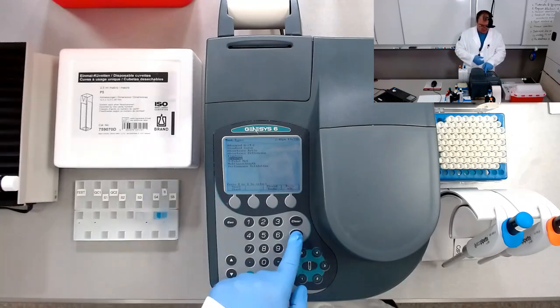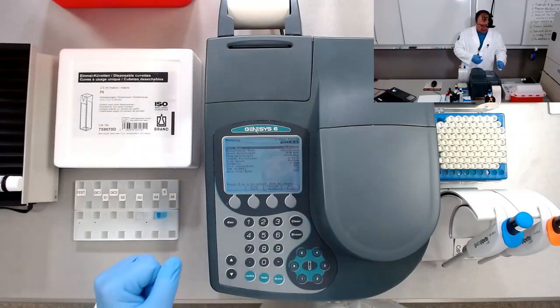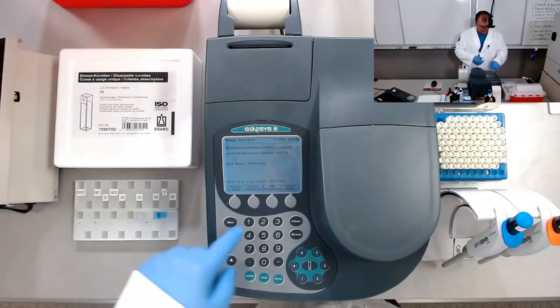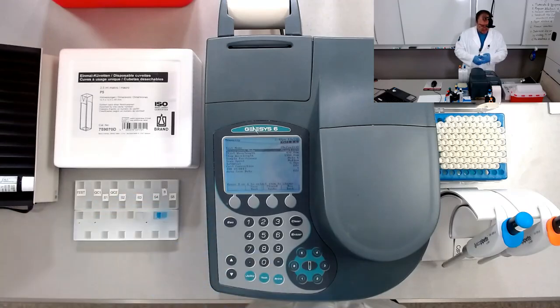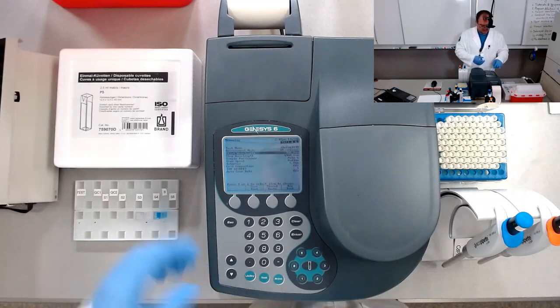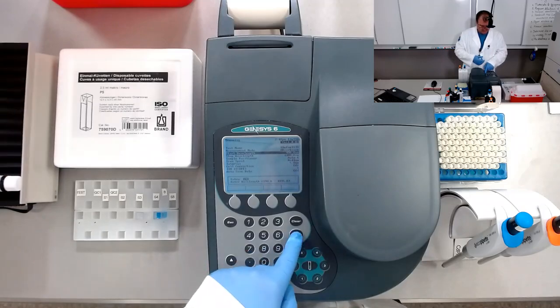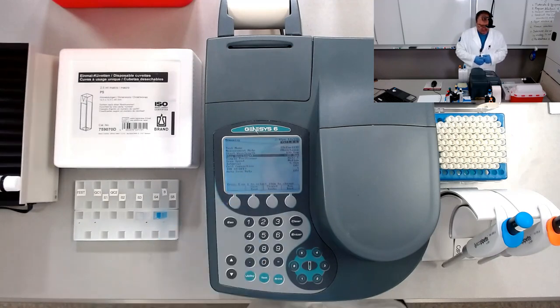So in scanning here, on the Genesys 6 spectrophotometer, we'll have the name for the test. Let's say we are going to place A, let's say 1, enter. The measurement mode will be absorbance. For wavelength, we'll start from, let's think about 190 nanometers, deep in UVC, remember that, and let's go to a stop wavelength of 1100, which is in infrared.